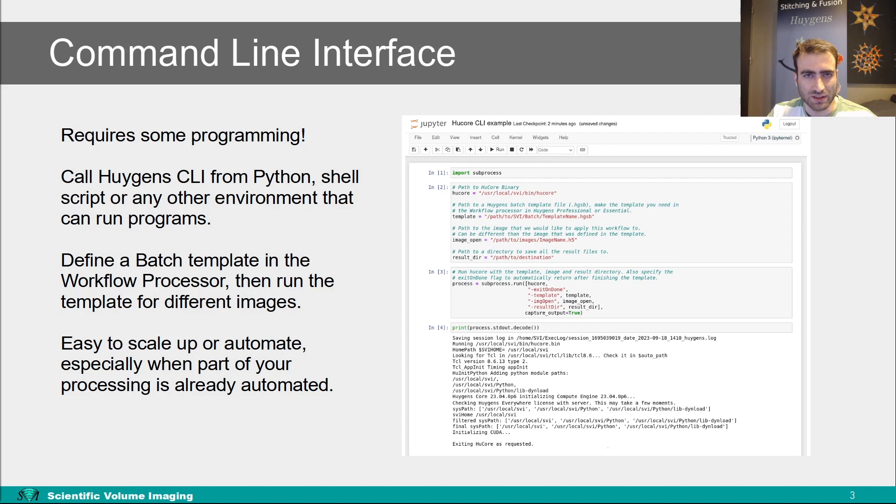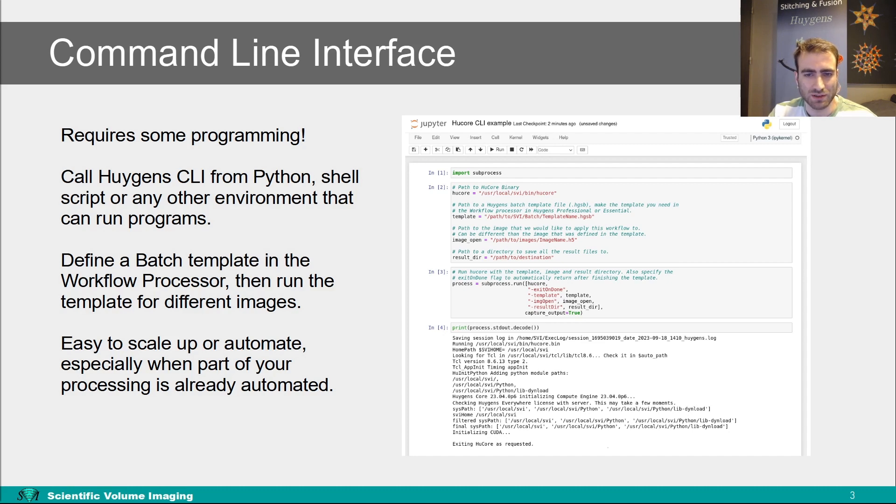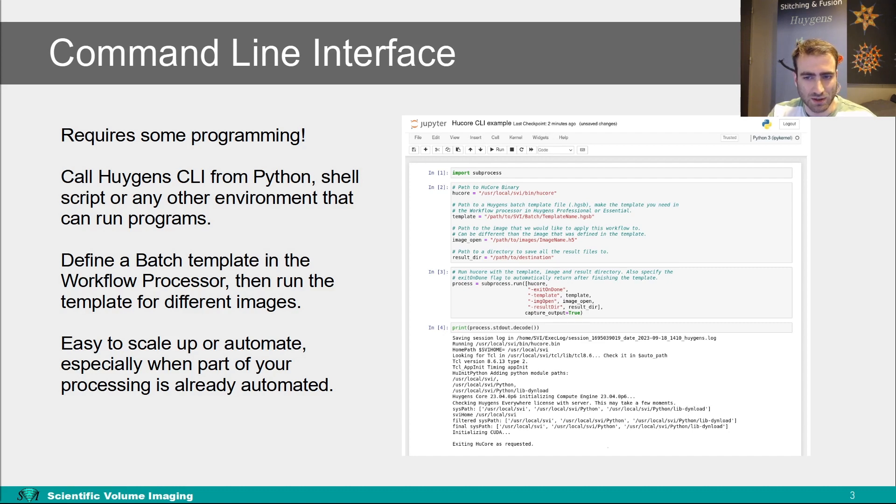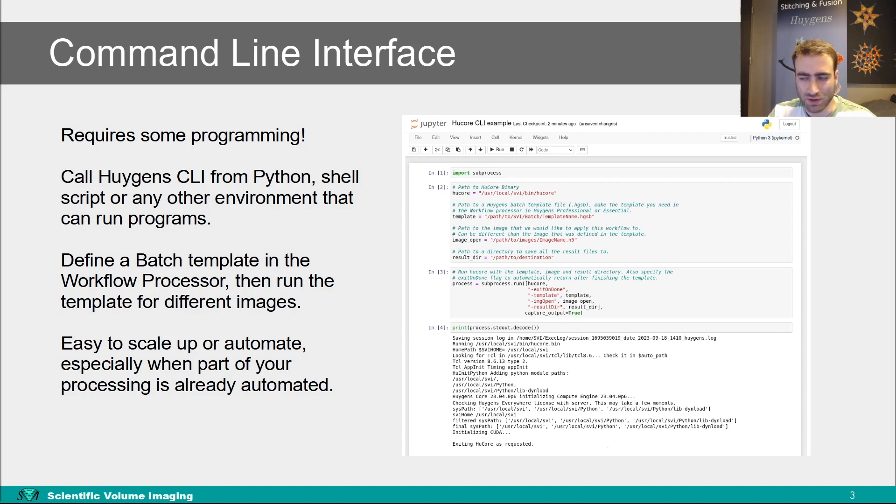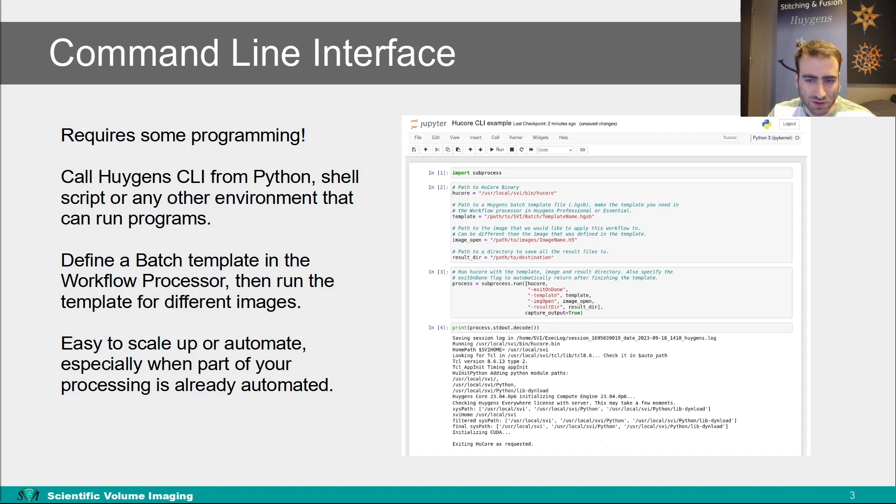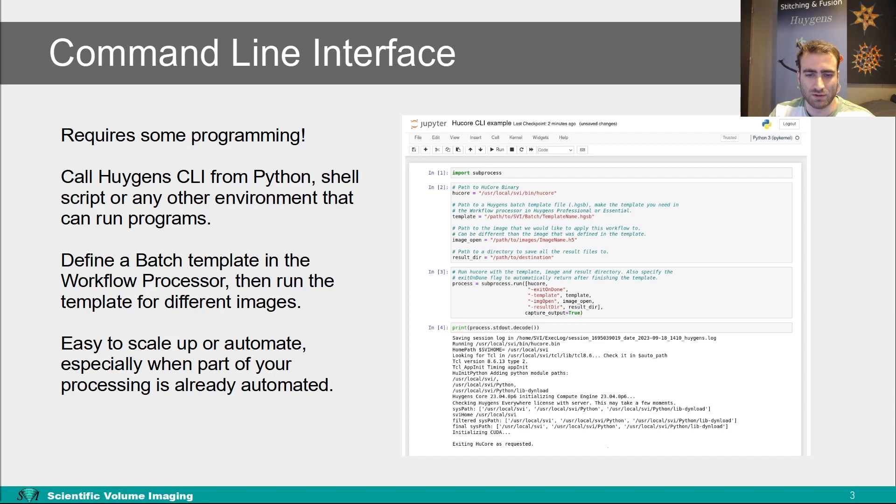What the command line interface effectively does is that it takes a batch template that you have made in the workflow processor in Huygens pro or essential, and it runs that template with the subject image and destination easily replaced. With the command line interface, it is easy to scale up and automate more of your processing. When for example you have your own python scripts for processing your data, or when using a workflow managing software package. When using a big workload managing software package to set up a high throughput system, you can use the command line interface from Huygens to write the deconvolution steps and offer them via that package. For example, some of these packages are slurm and orchestra, but there are many more.